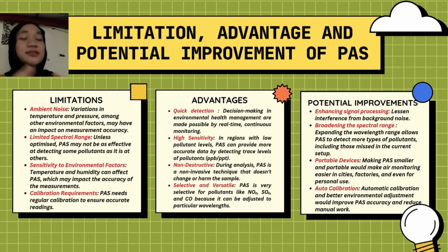PAS has many strengths. Firstly, it is highly sensitive, meaning it can detect pollutants even in a very small amount. This makes it very great for early detection in areas with low pollution levels. Other than that, it is also non-destructive, meaning that it doesn't change or harm the sample that is being analyzed. Another great feature is real-time detection, which helps to make quick decisions in monitoring our air quality, for example.